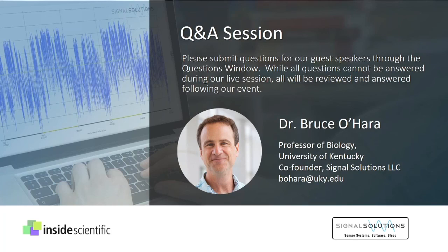Okay. Quite a few people have asked about vibration from things like cage racks. Can you talk a bit about whether vibrations in the room interfere with the breathing signal and the functionality of the system, and how one goes about addressing that?